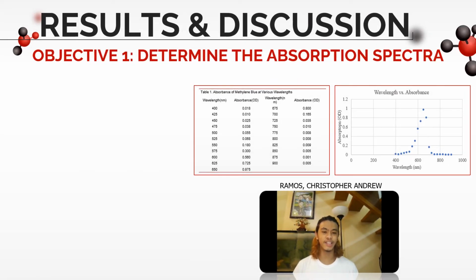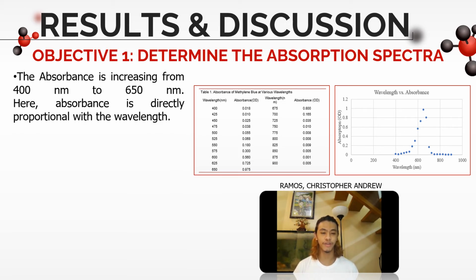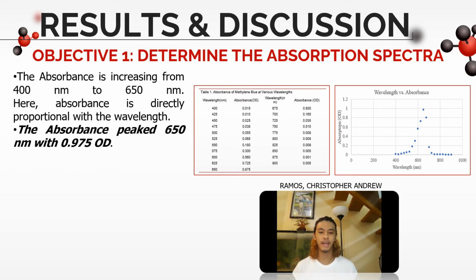Looking at the data and its corresponding graph, we could observe that the absorbance is increasing from 400 nanometers to 650 nanometers. In here, the absorbance is directly proportional with the wavelength, which means that as the wavelength increased, the absorbance increased as well. We could also observe that the absorbance peaked at 650 nanometers with 0.975 optical density.